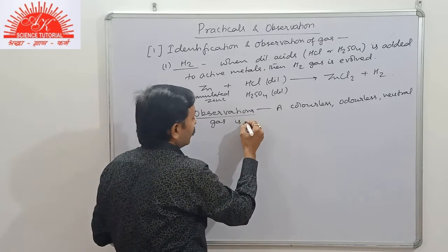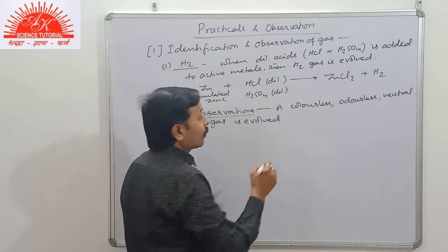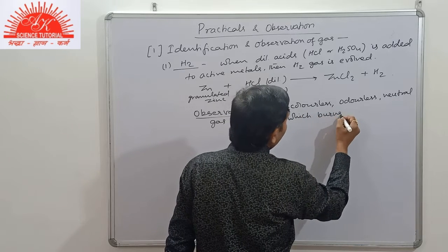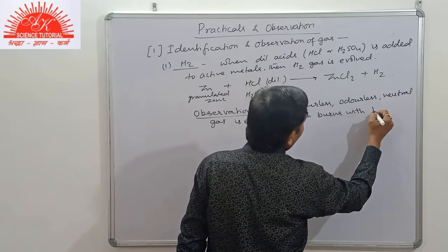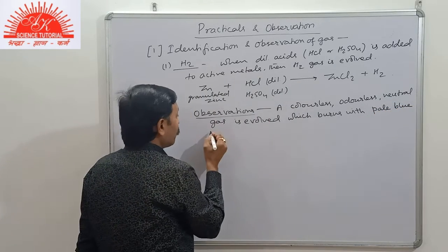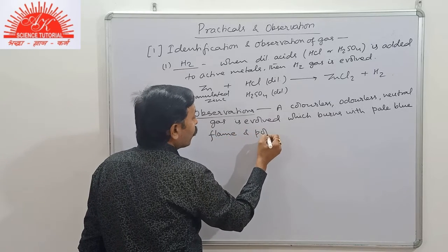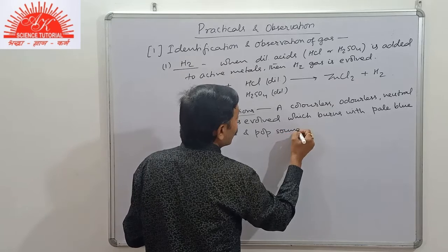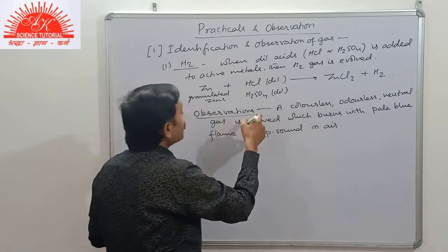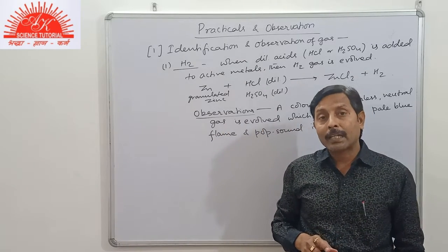Is evolved, which burns with pale blue flame and popping sound in air. So this is the observation related to hydrogen gas.